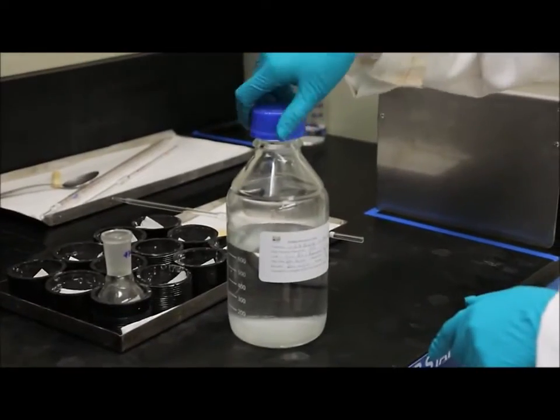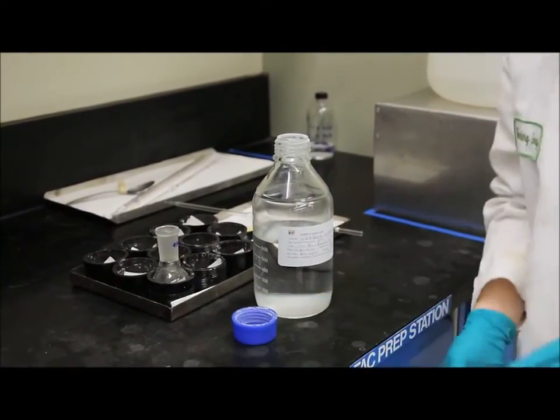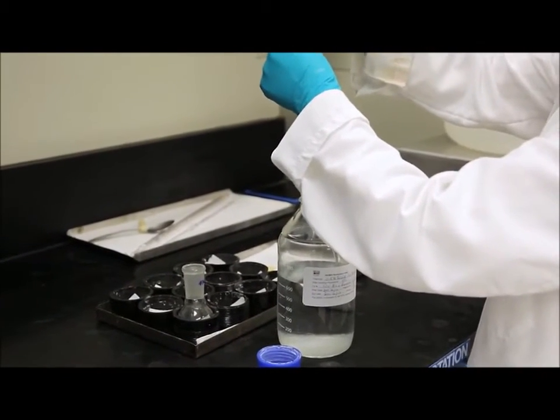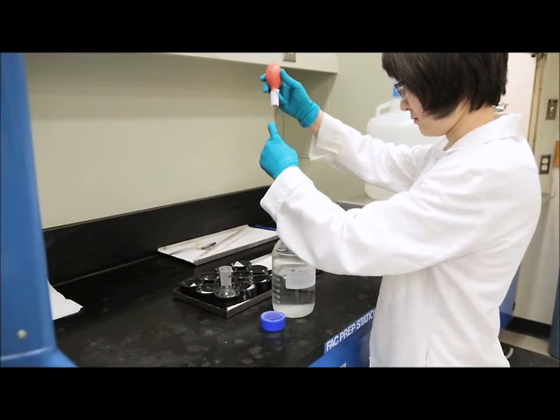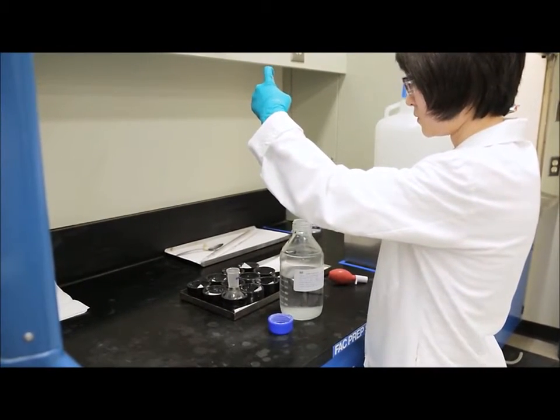The next step is pipetting our 0.5 normal sodium hydroxide and methanol solution into the flask. Our 0.5 normal sodium hydroxide and methanol is going to act as our base catalyst in the reaction.